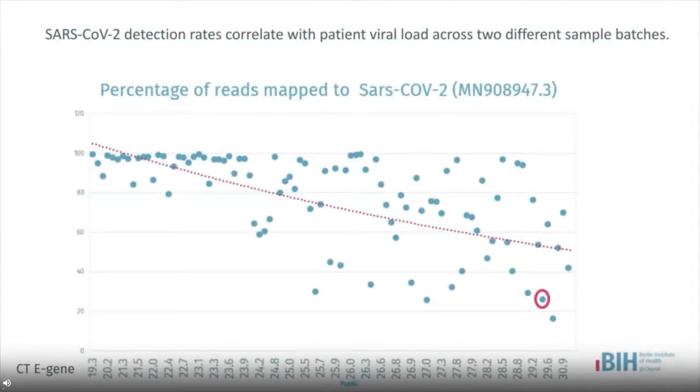The primary use of the developed pipeline is to characterize sequences that are enriched with the specific NGS panel. However, like I already mentioned in the previous slide, the application of our pipeline allows for annotation of contaminating sequences.